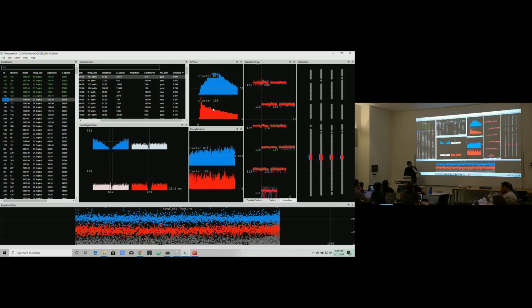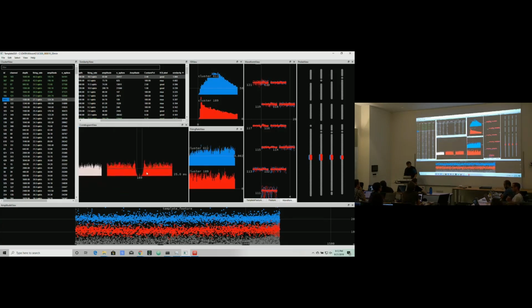When your neurons are firing spike trains basically at random times, that leads to exponential distributions of interspike intervals, which is what this red one looks more like. And it also leads to these relatively flat, except for the refractory period, these relatively flat autocorrelograms, which are basically just the probability that the neuron will fire another spike after one spike is basically constant regardless of how far in the future you're looking. There's kind of no dependence. That's what makes it a Poisson process.